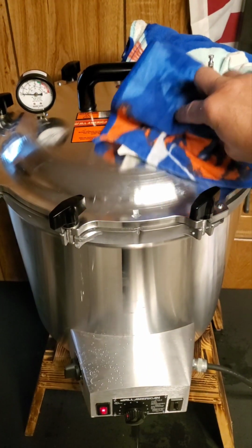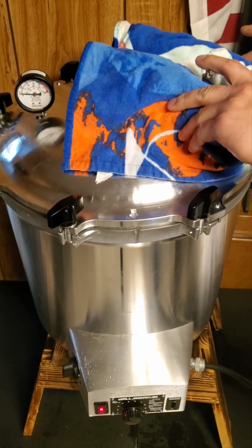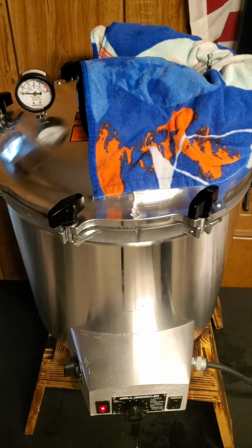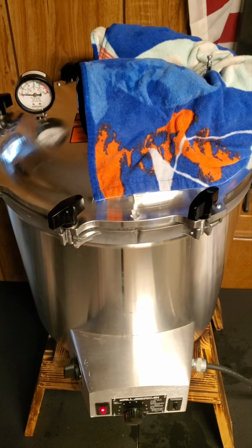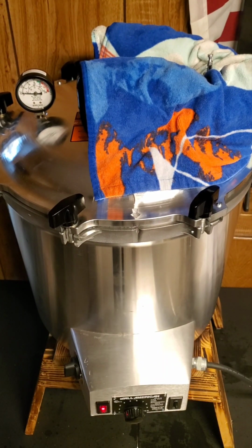And see, the water's running out here because it is pouring out. All right, boom. That's an inch or so over the line, and it's still spraying out. So let that sink in. If you're having troubles with it blowing water everywhere, don't freak out. It's normal. Get you a towel, clean it up.